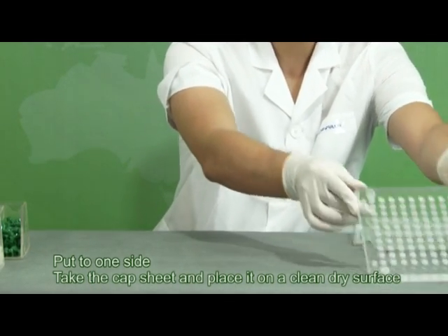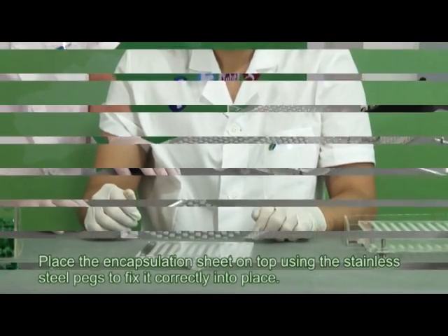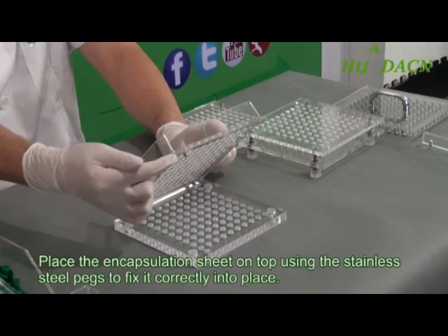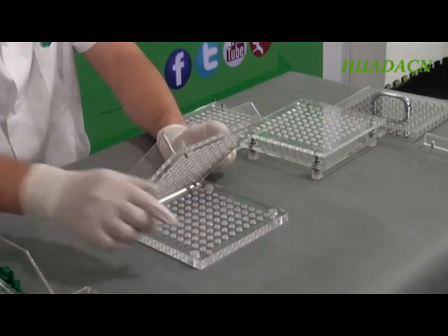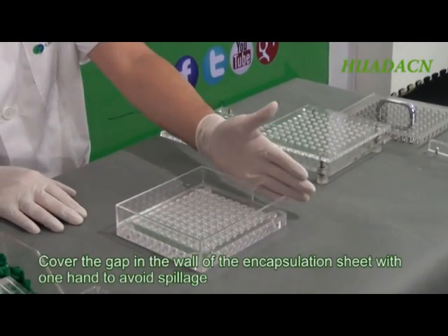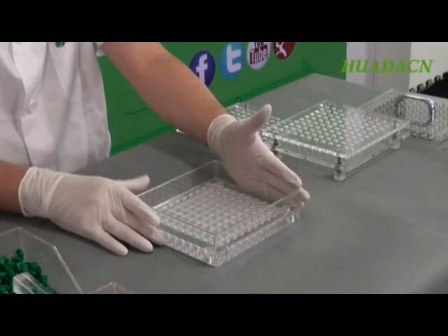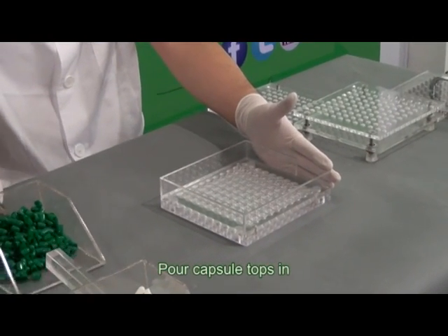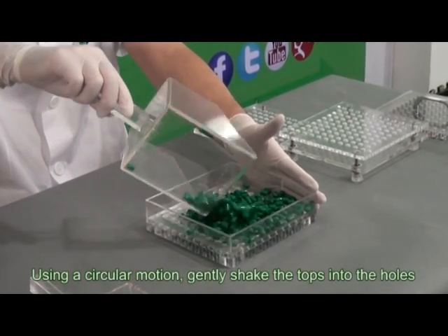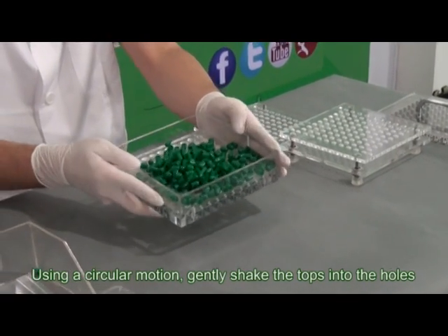Take the cap sheet and place it on a clean, dry surface. Place the encapsulation sheet on top, using the stainless steel pegs to fix it correctly into place. Cover the gap in the wall of the encapsulation sheet with one hand to avoid spillage. Pour capsule tops in and, using a circular motion, gently shake the tops into the holes.